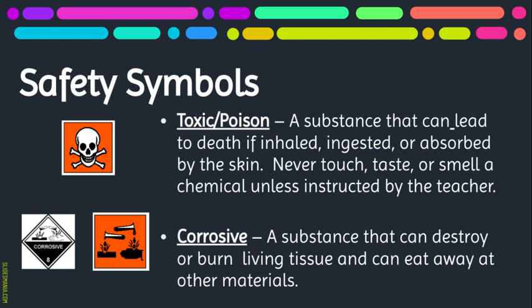A lot of us know that a skull and crossbone means toxic or poison. So you should never inhale, ingest, or absorb it by your skin. Never touch, taste, or smell a chemical unless the teacher instructs you to. So don't just think that, oh, it looks like water, I'm going to taste it. Oh, it looks like water, I'm going to smell it or stick my finger in there.